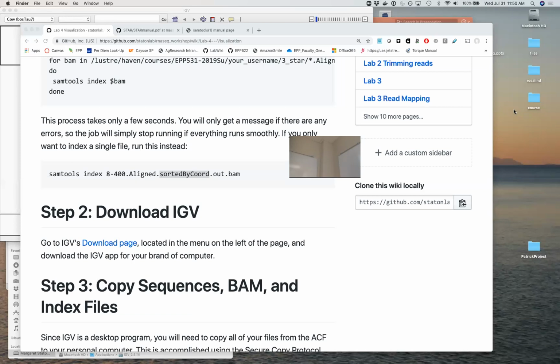Did you select the BAI file? Just do the BAM file. Don't worry about the BAI. It's going to find the BAI without you having to do anything. It's there. Actually, if you right click on that one and just repair. I just forgot twice.